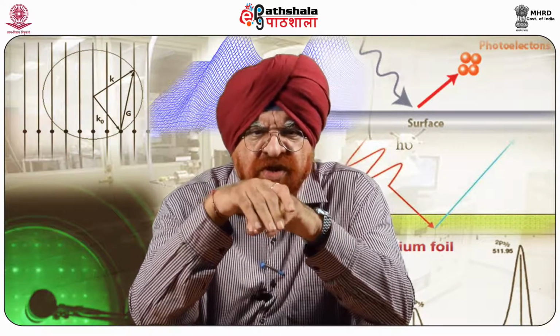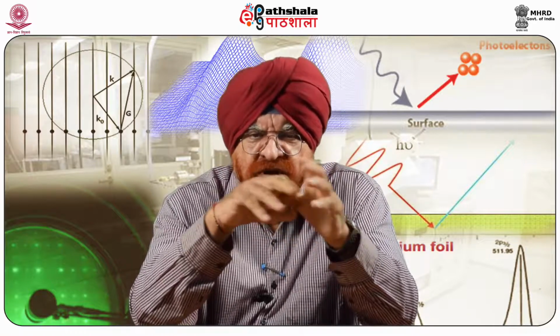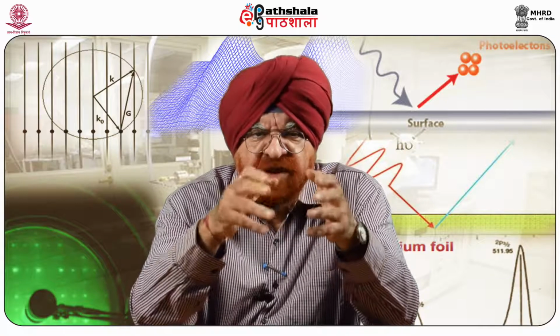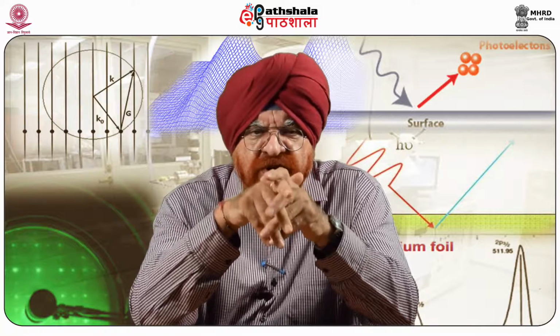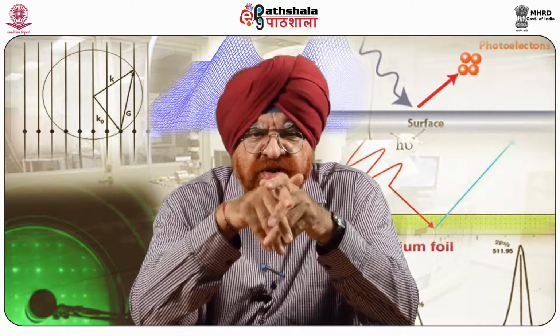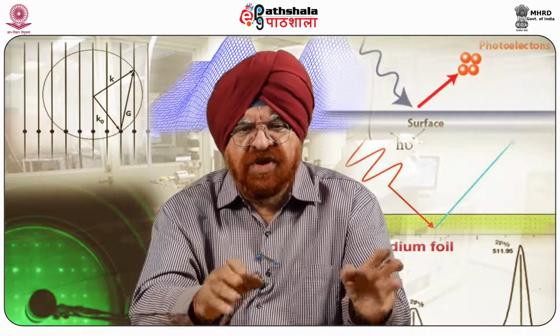The MFM measurements for the manganese-free silicon and germanium films, both amorphous and annealed up to the crystallization temperature, suggest that magnetic activity is absent. This is the experimental result, as expected, since it was also observed in the set of magnetic-free silicon and germanium samples, as I said, done by Ferri et al.